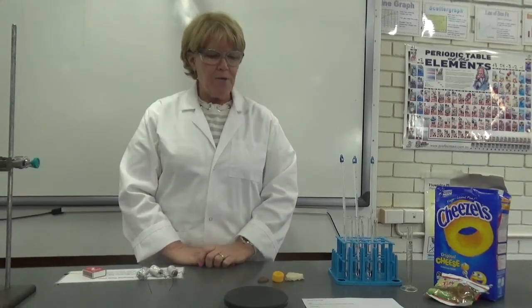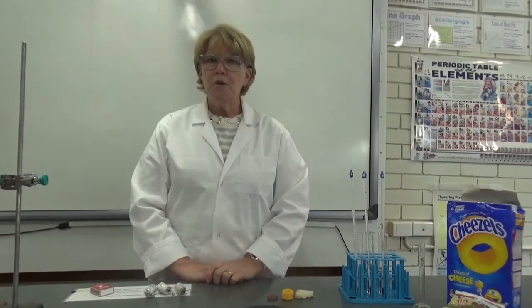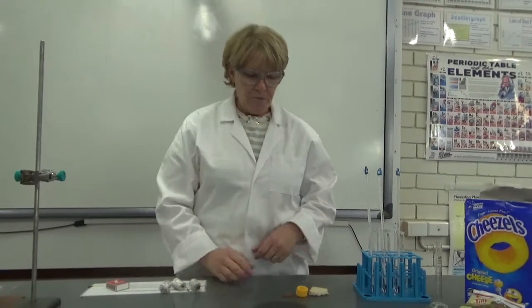Hello Year 7, it's Mrs V and we are back in the lab for another exciting practical. So today we are going to look at the energy content of different foods. Did you know that you get your energy from the food that you eat? So today we're looking at three different foods.